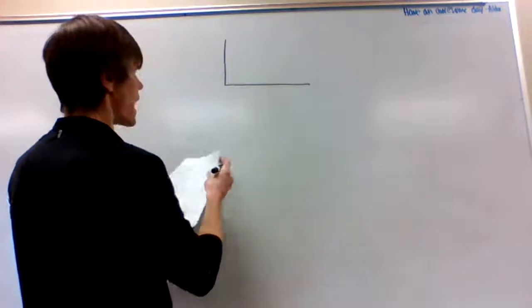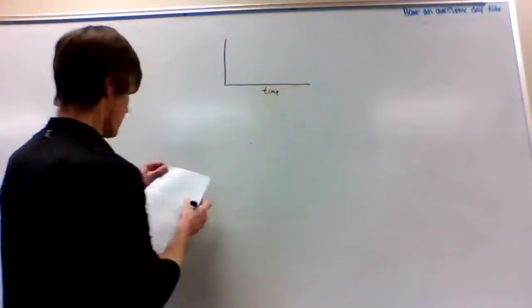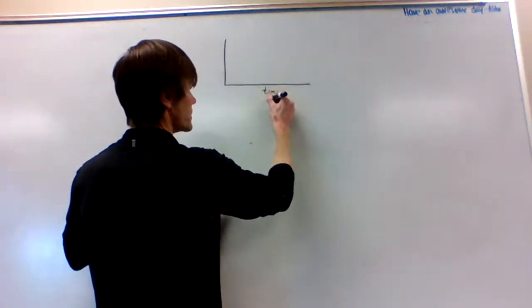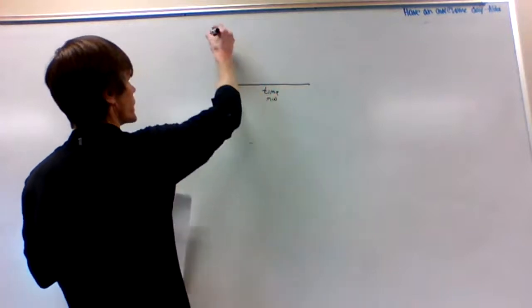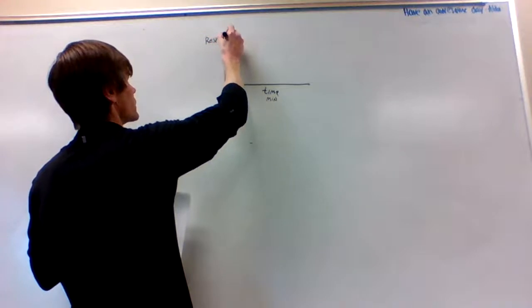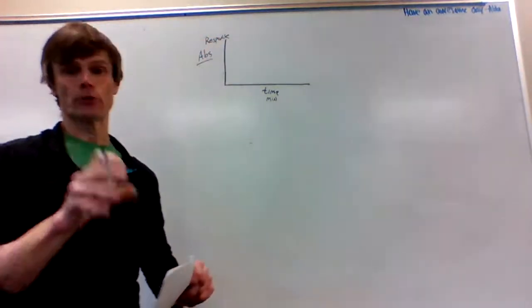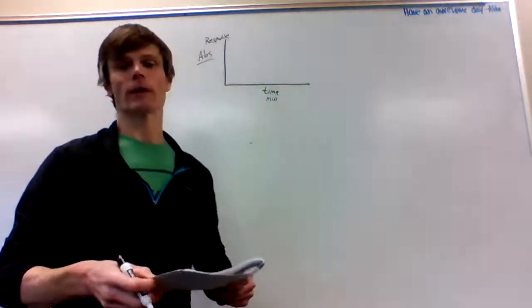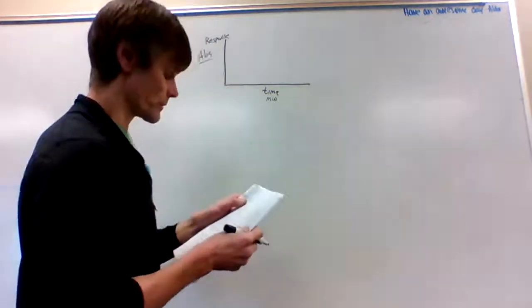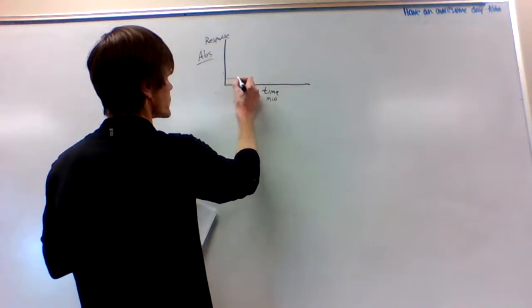So we have our time on this scale, and we're going to assume this is in minutes. This is time in minutes. And we have our detector response. We're using absorbance. Remember, we learned about absorbance. Absorbance is a good detector to use in a lot of our chromatography experiments for certain reasons, so we'll discuss that. So let's look at our first chromatogram.